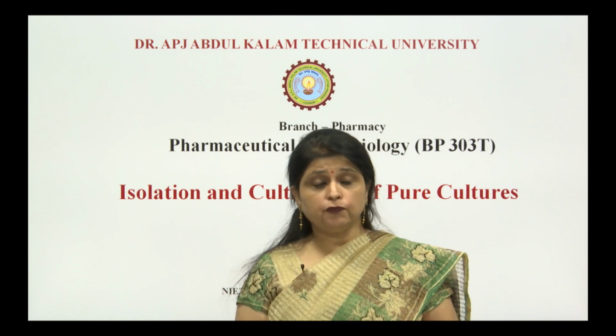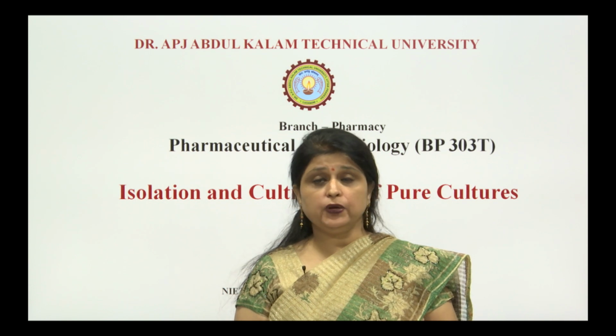If you have gone through my lecture number 4, in that lecture I covered the nutrient media, how we can prepare nutrient media, and what the various agents are which we need to add into the nutrient media. We also learned the techniques, how we can prepare stabs, slants, and Petri plates containing nutrient media which can be further used for isolation purposes. For that you need to follow lecture number 4, that is, what ingredients we need to add, and how we can make the slants, stabs and Petri plates for further use in experiments.